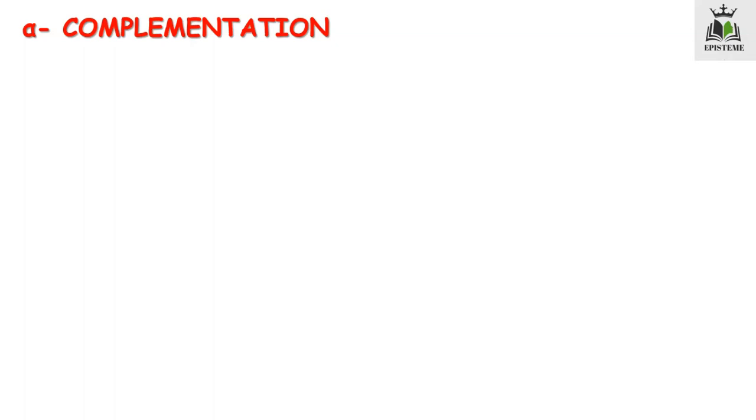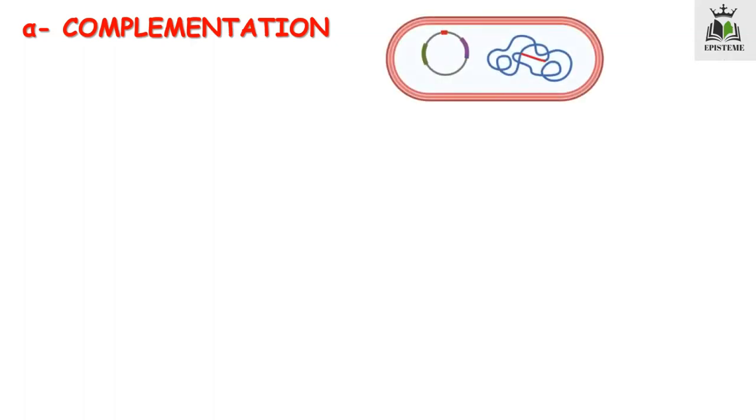So in the laboratory, we usually use E. coli cells, which are usually the DH5 alpha E. coli cells, and we incorporate the cell with a modified plasmid. This modified plasmid has the lac Z region, which codes for only certain subunits of the beta galactosidase enzyme.